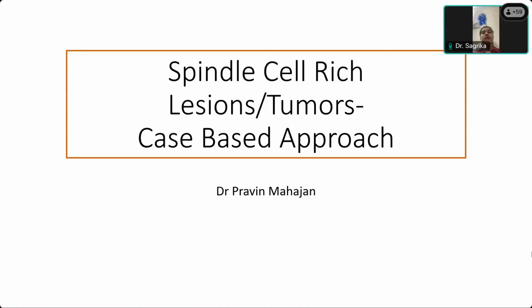Sir, elongated cells with tapered ends. Very good, very good. Anything else? The nucleus is elongated. Yes, very good. So the cell has to be elongated, the ends could be tapered or blunt, and the cell has to have a nucleus which is also slightly elongated. It can be oval or elongated. And it has a length more than its width, but it is centrally wider.